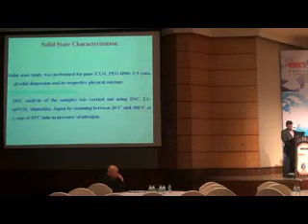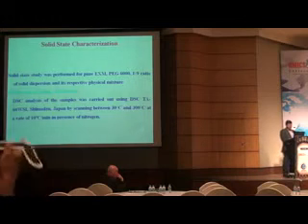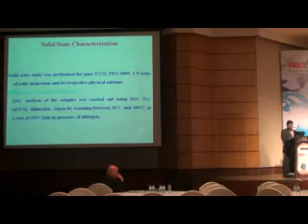Then the saturation solubility of the products obtained was studied by taking excess quantities of each preparation in a glass vial with 10 ml of distilled water, to understand the solubility improvement after preparing the solid dispersions and physical mixture. And similarly, the exemestane content was estimated using simple HPLC analysis.